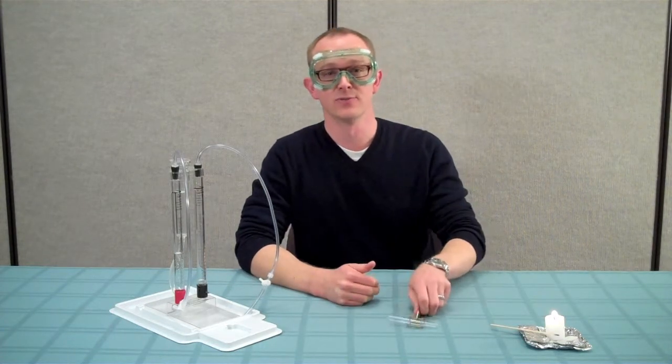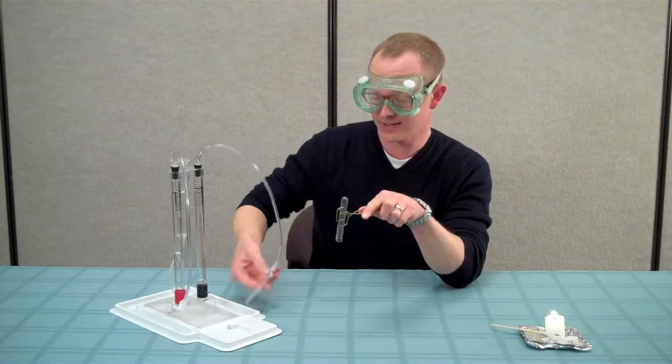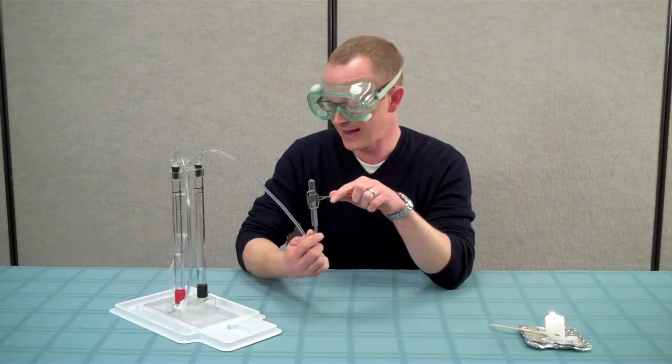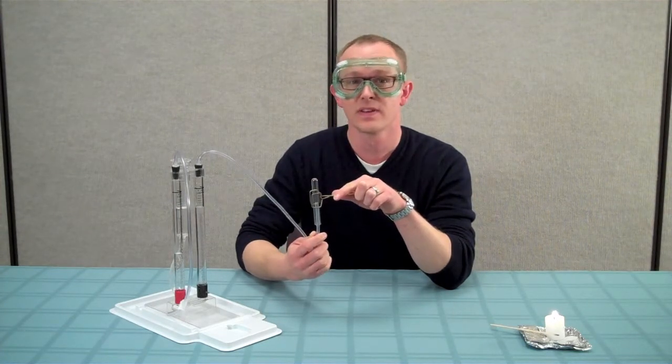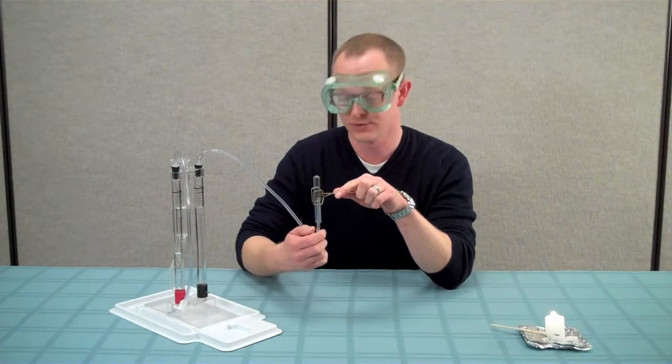First, take an inverted test tube and insert the open end of the gas supply tube into the mouth of the test tube. Open the valve, which will release the gas into the test tube. Leave the valve open until most of the gas has exited the storage column, and then close it.